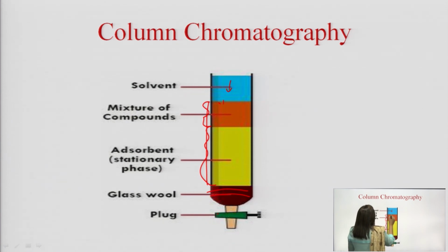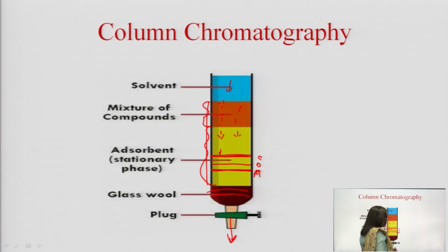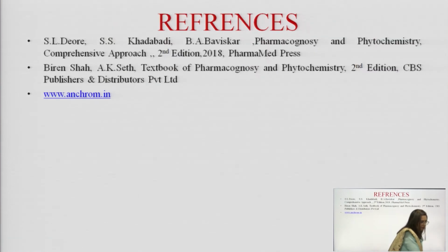This solvent with time will imbibe the sample and will reach the stationary phase. Once it starts reaching the stationary phase, according to the affinity or separational power, various bands will start separating as it nears the exit, and finally components A, B, C would be separated out. And since A has lesser affinity, it is washed out initially, the first eluate at a given temperature at a given time would be eluted at the beginning.